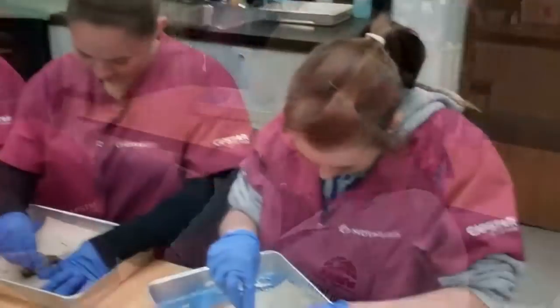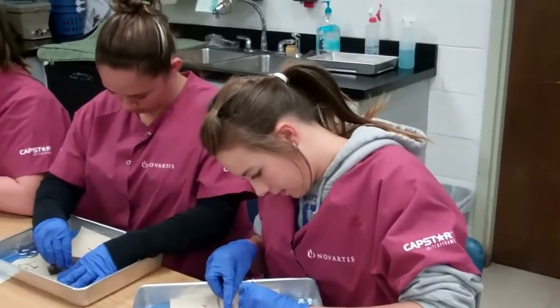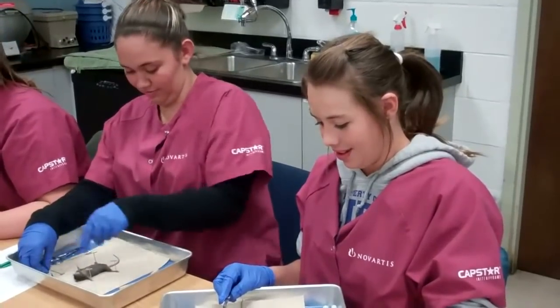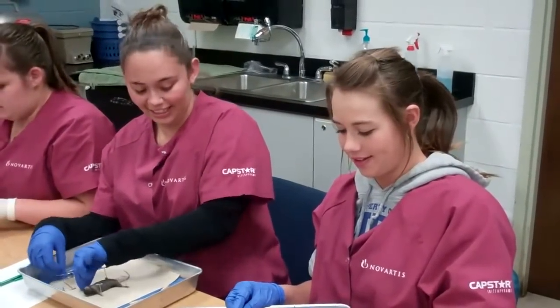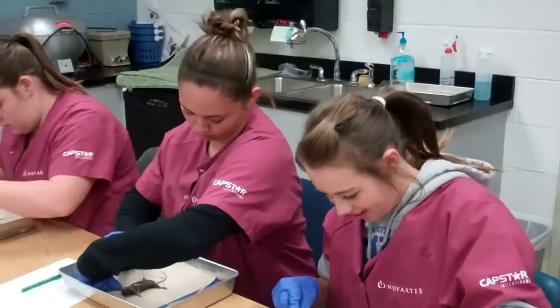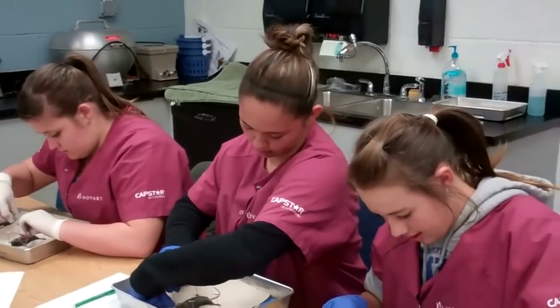I'm Blake Fossett, and I go to Lowland High, and we are dissecting mice today. What's the hardest part about dissecting this? Probably cutting it open, like getting it first. The first cut is the deepest.